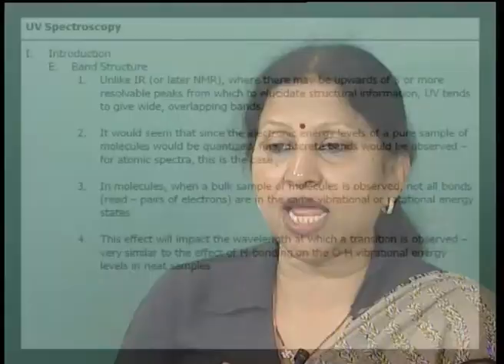So, you see there are certain very minute points that also need to be considered. It is not that every jump is allowed, first and foremost. Then if there are too many chromophores, these jumps may have peaks which overlap with each other, and therefore it is important to understand how to do it and when to do it.